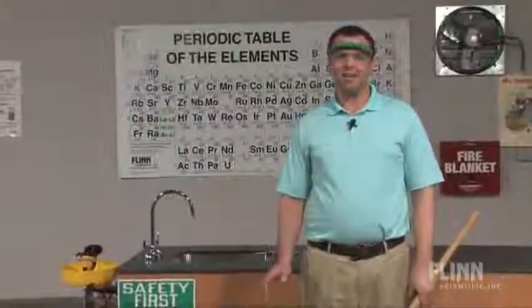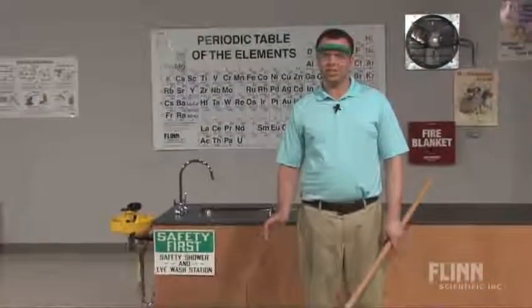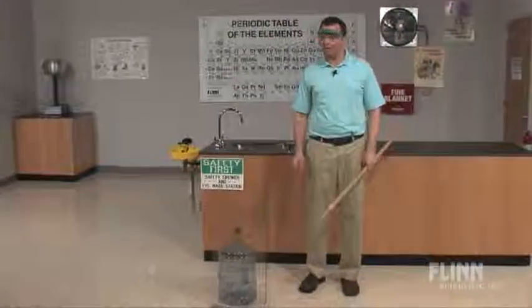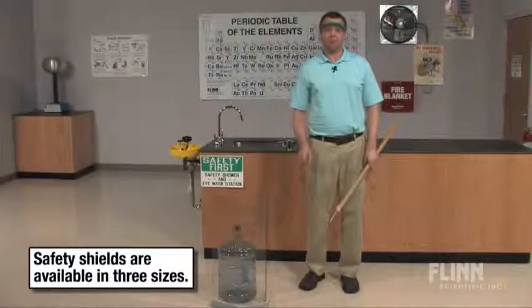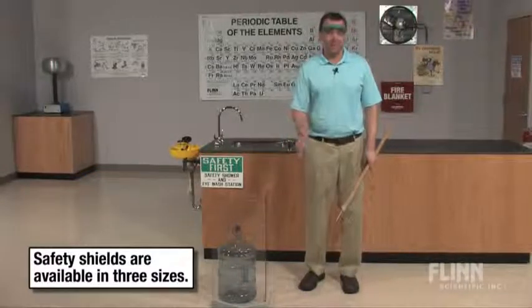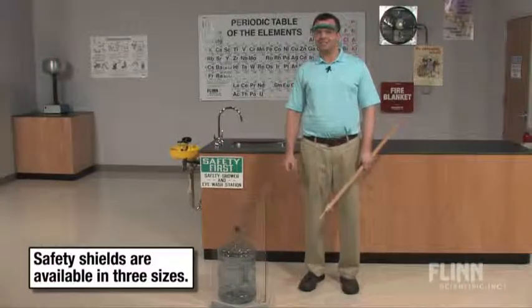Always use a safety shield if there's any chance that an object could be propelled by force during a demonstration or a lab activity — not only to protect your students, but to protect yourself as well, much like during this demonstration.